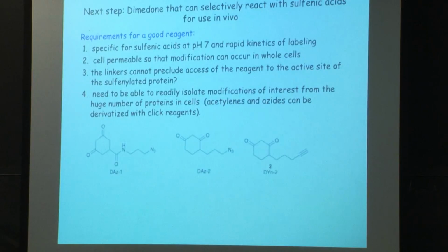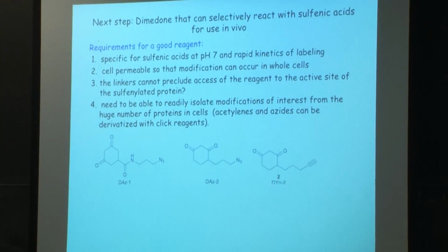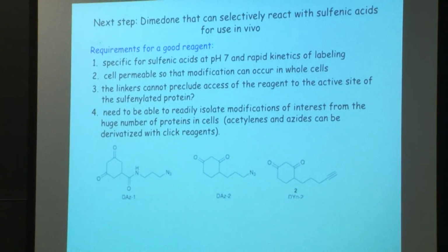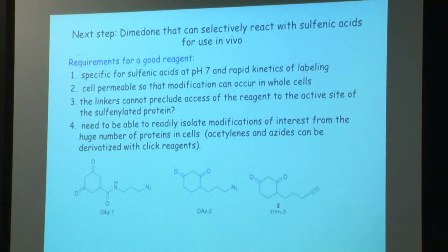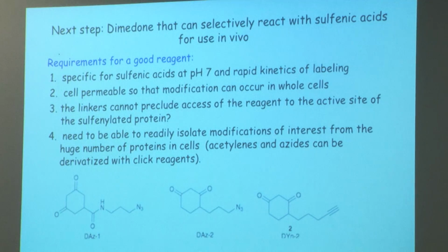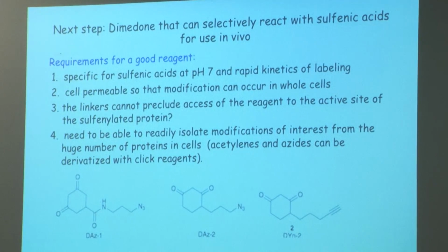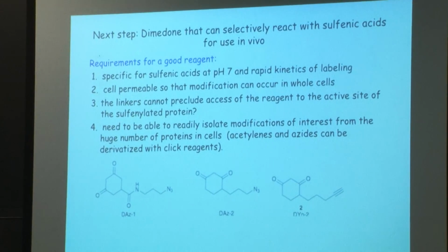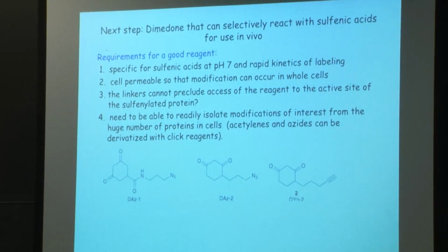So if you go back over here, we're trying to decide which one we want to use. And so that's the kind of experiment they did to try to design. So what are you concerned about in this experiment? The first thing is what has to happen with this molecule. It needs to get in the cell. Okay. So I guess they know it gets into the cell, but they didn't really do any experiments to determine how much got into the cell.